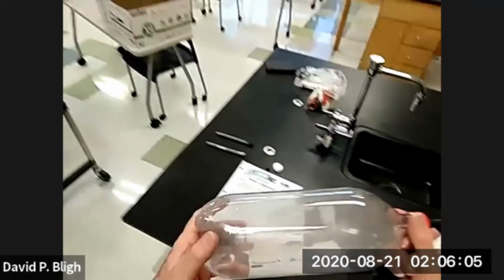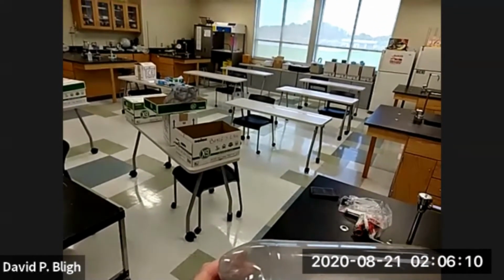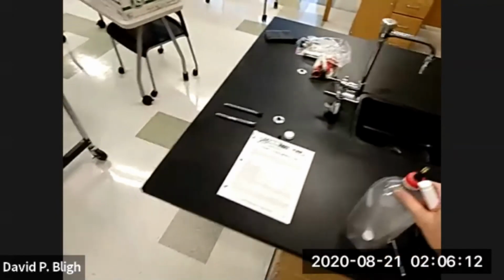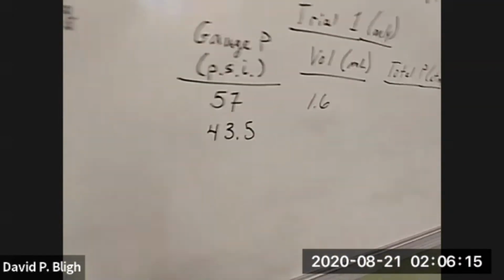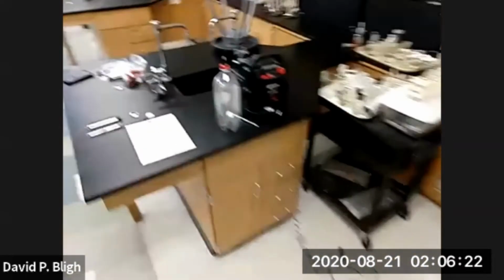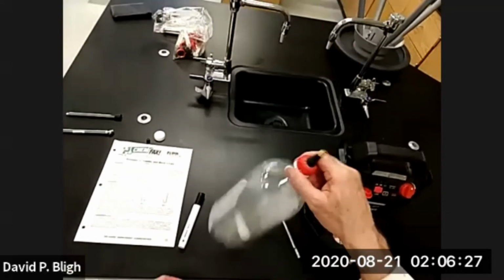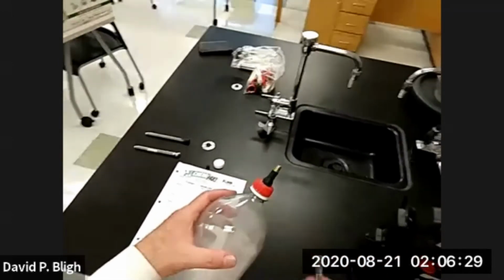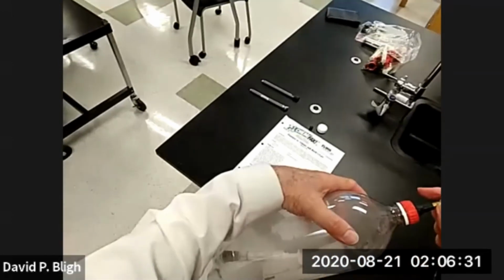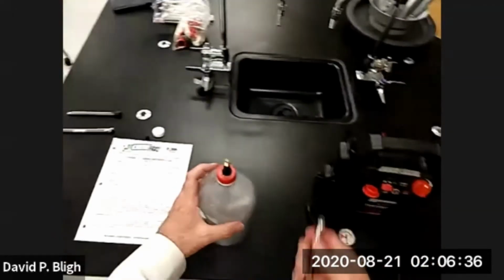And the volume then is, let's see, about 2.3 milliliters. Remember that last digit is a guess. Okay? And we just keep doing that until there's no more pressure coming out. Let's let a little bit out and watch the plunger. Let's do it again.